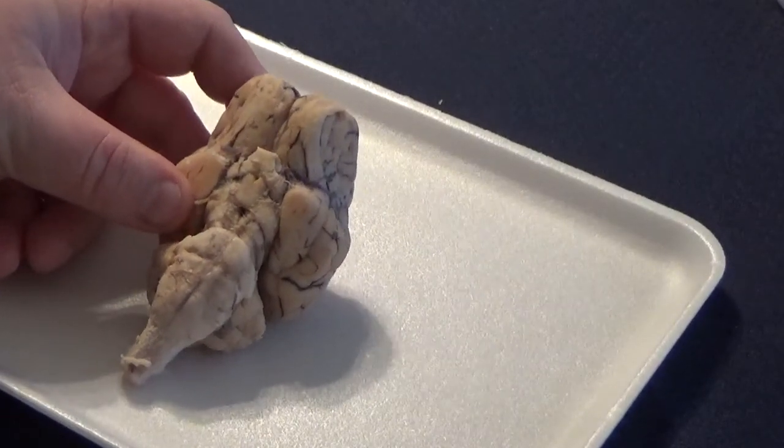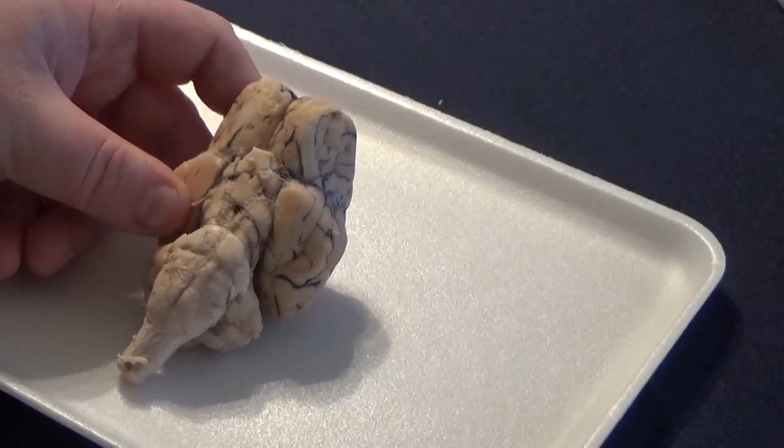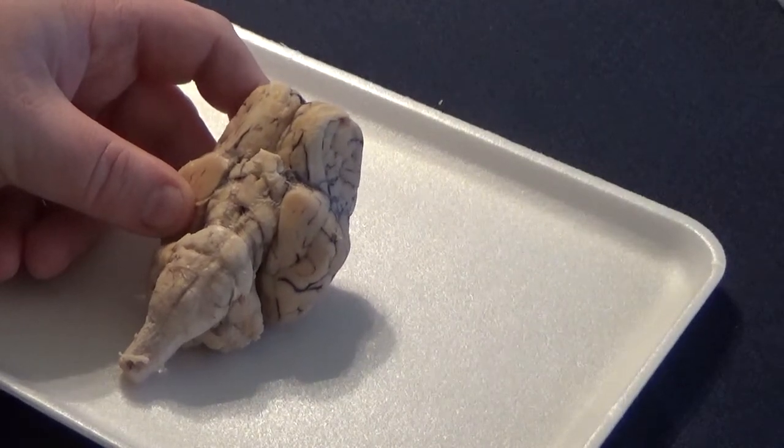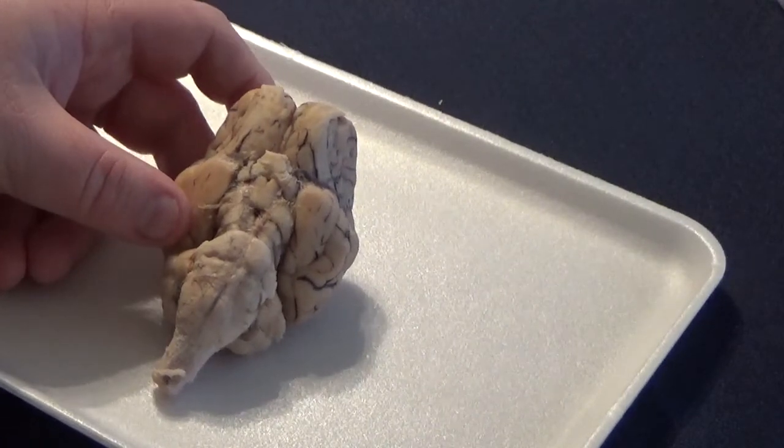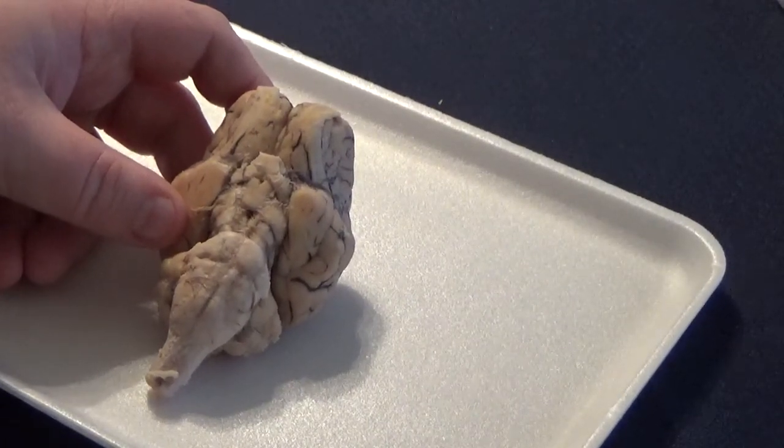So that concludes our study of the outer features of the brain. What we're next going to do is study the inside of the brain and get a better understanding of what we can observe by making our dissection.